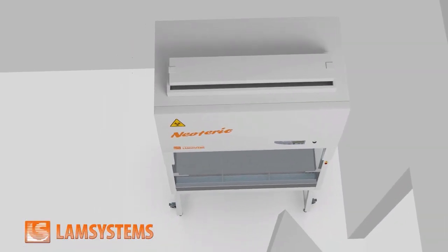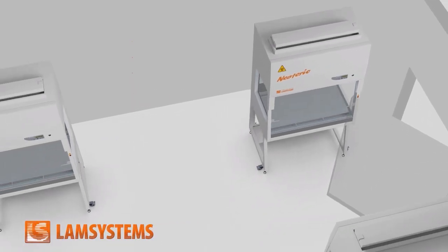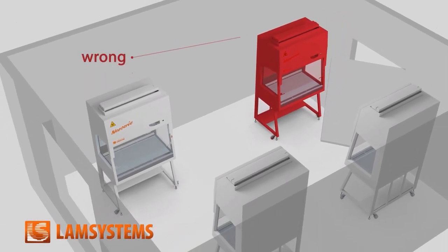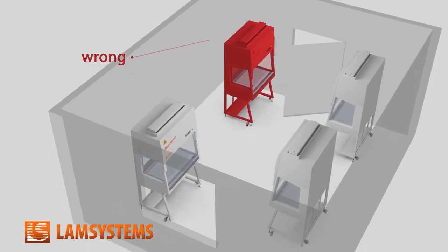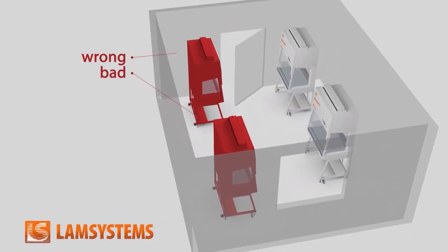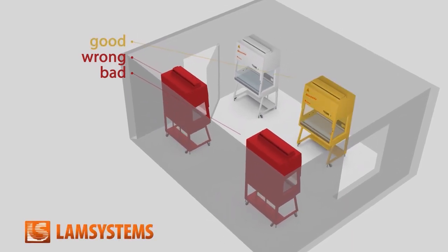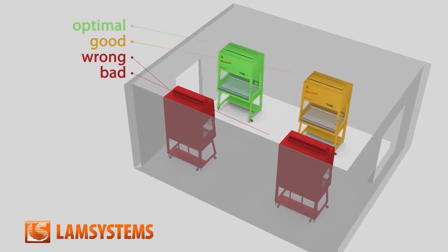After the unpacking and assembly of the cabinet, you should choose its correct location in your laboratory. According to the recommendation of World Health Organization, a biosafety cabinet should be installed considering the existing airflows from windows and doors so that it would avoid drafts influencing the airflow in the cabinet. Remember that the proper airflow in the operating cabinet can be affected by portable fans, personnel going around, and even another operating cabinet at a close distance.